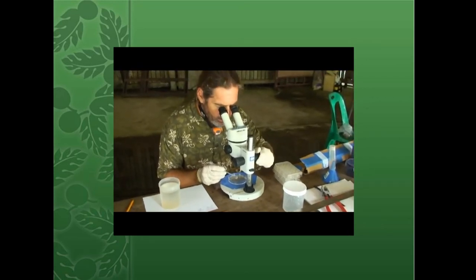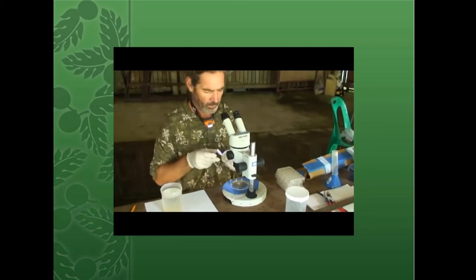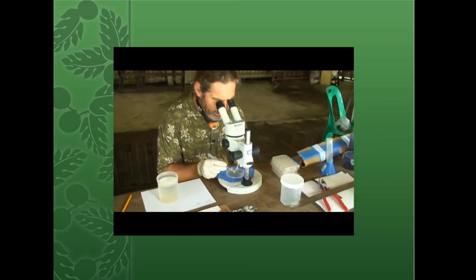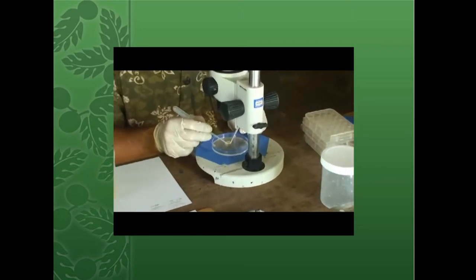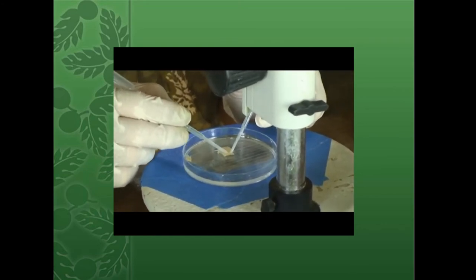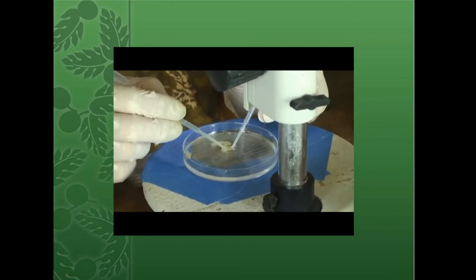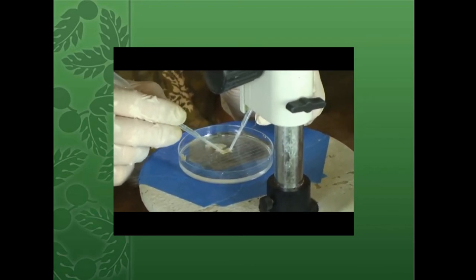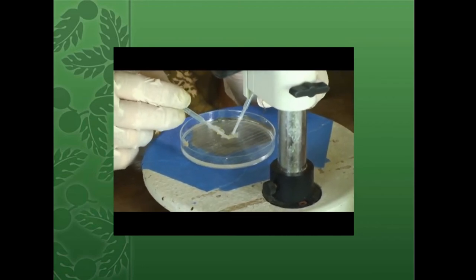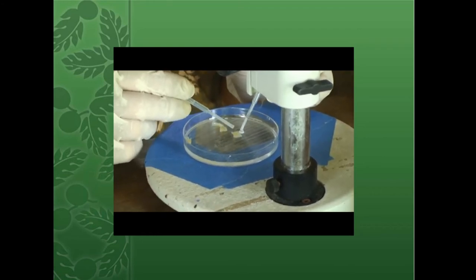and making sure that there's no eggs clinging to it. And if there are, I just gently wipe whatever tool I happen to be using across the top, and that frees up the last of those eggs that haven't been dislodged by all the shaking that we were doing over the past couple of days. Okay, so this one's looking clean now.